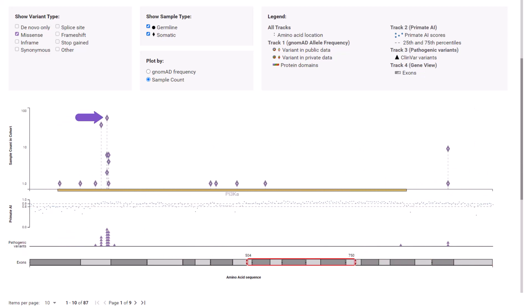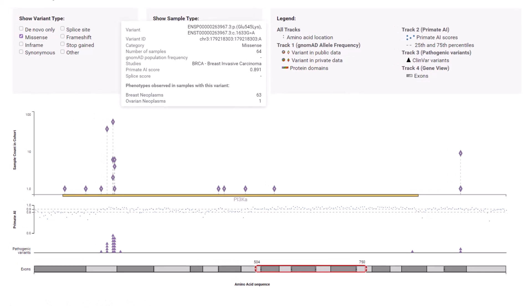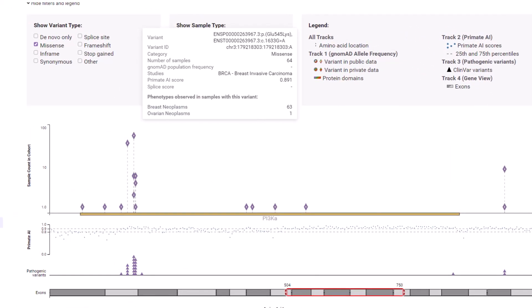In the needle plot, hover over the variant with the highest sample count in the yellow PI3KA protein domain. The variant details show 64 subjects observed with the GLU 545 to LYS amino acid change resulting from a G to an A nucleotide change at coding position 1633. 63 in the breast cancer study and one in the ovarian cancer study.